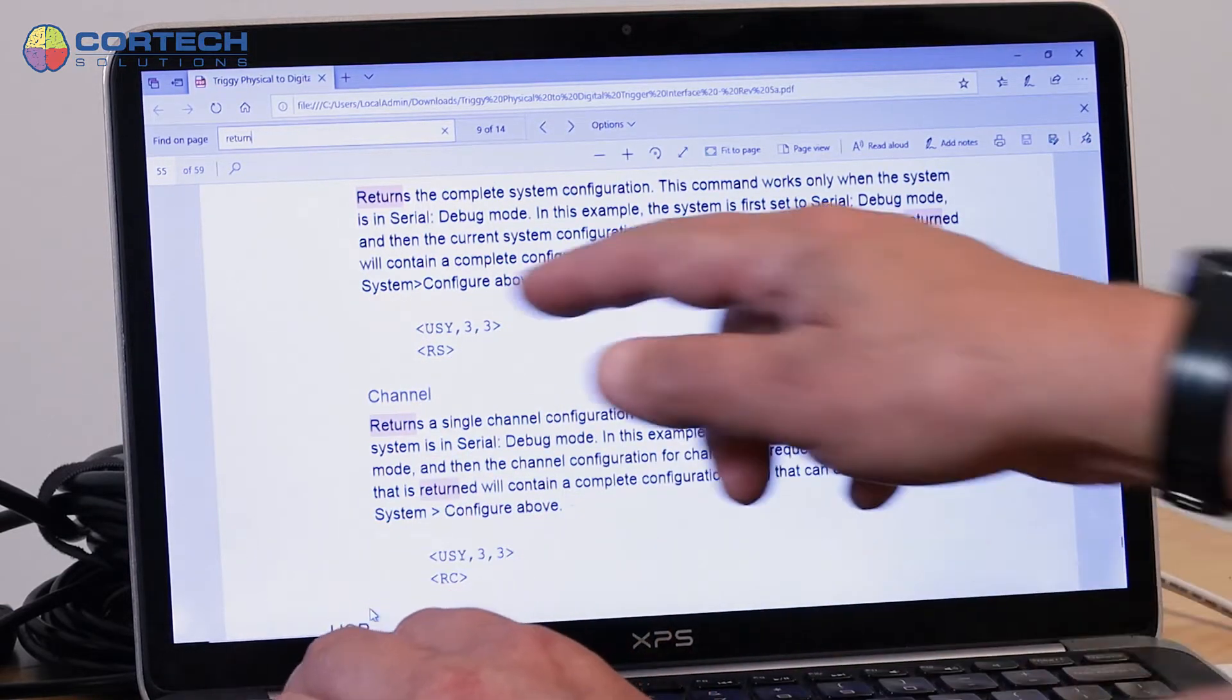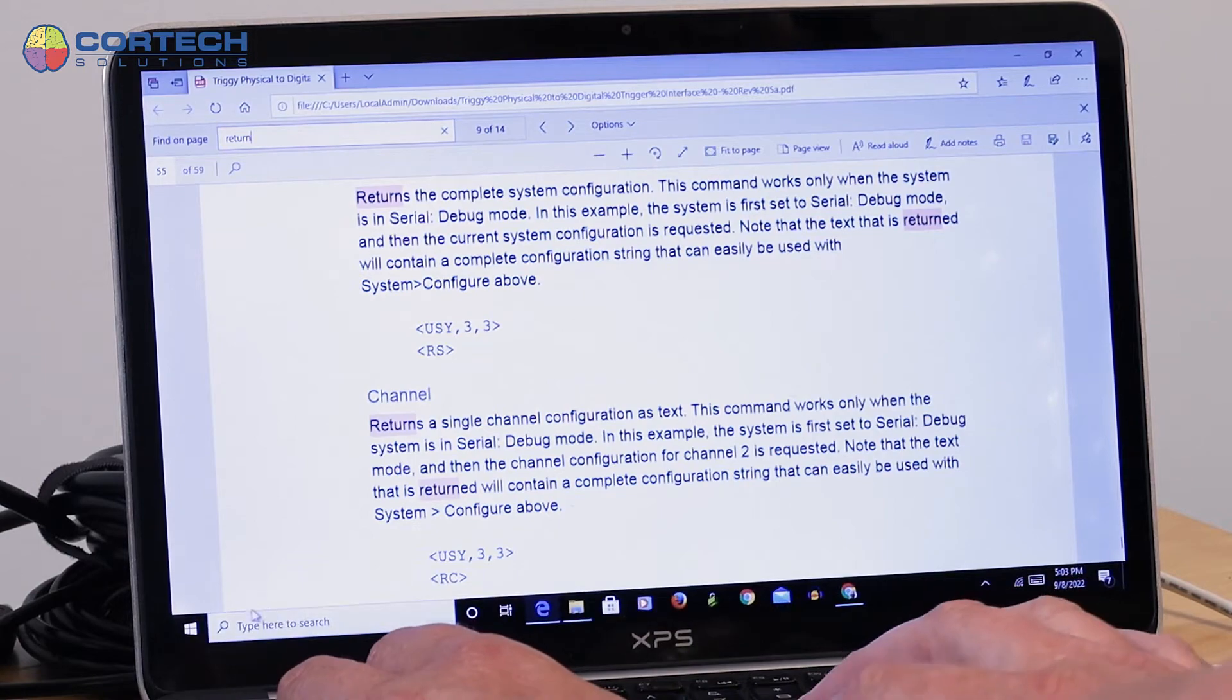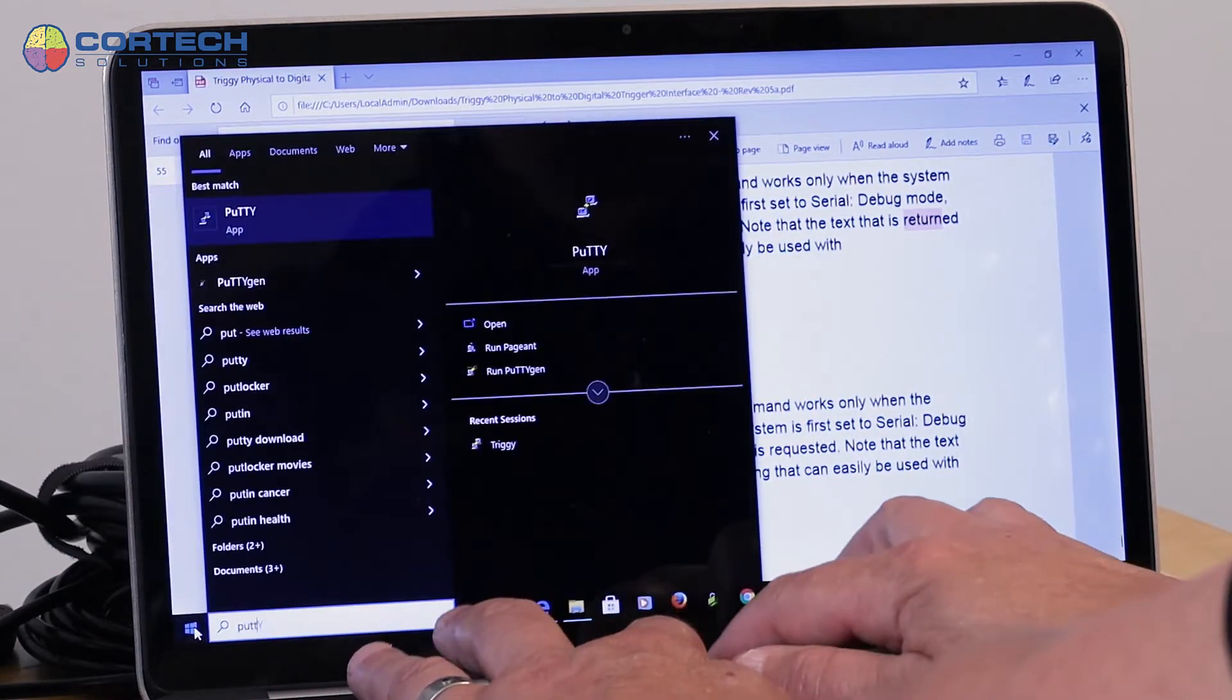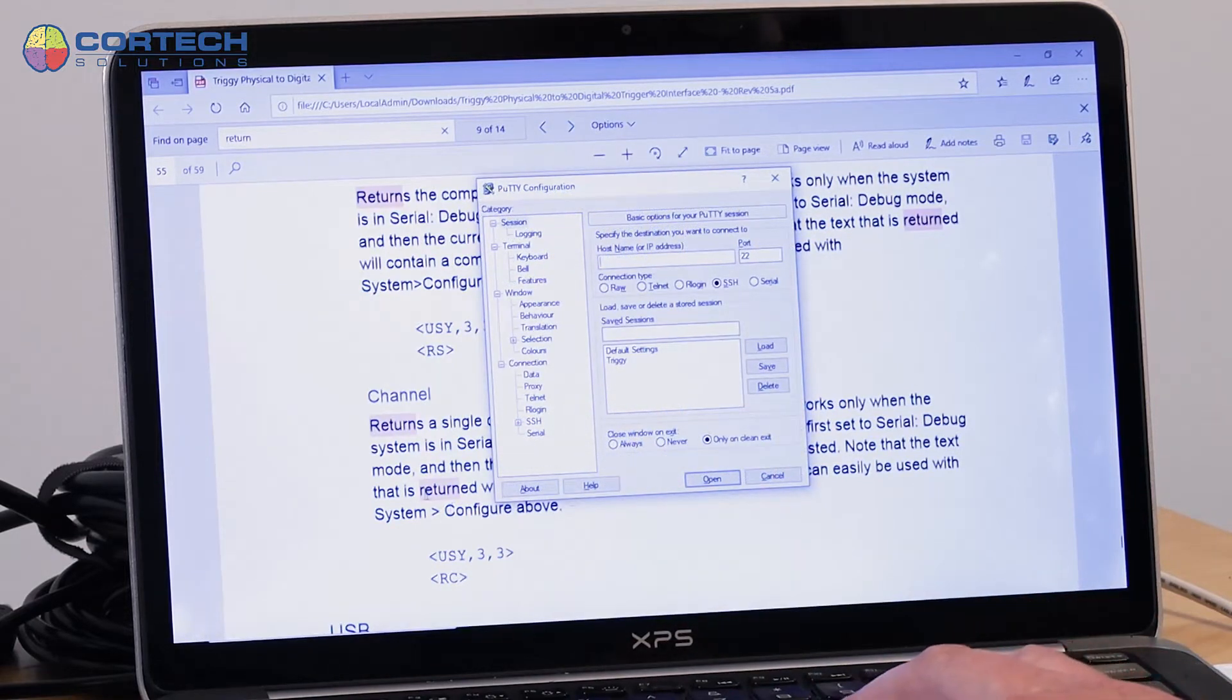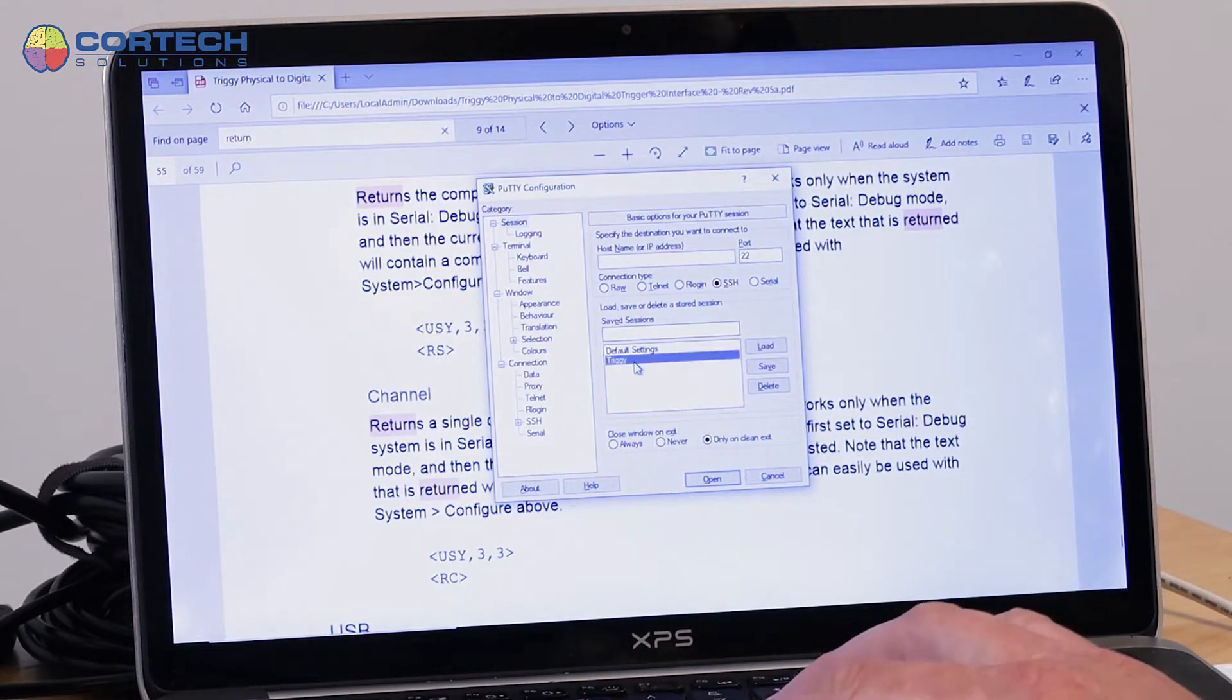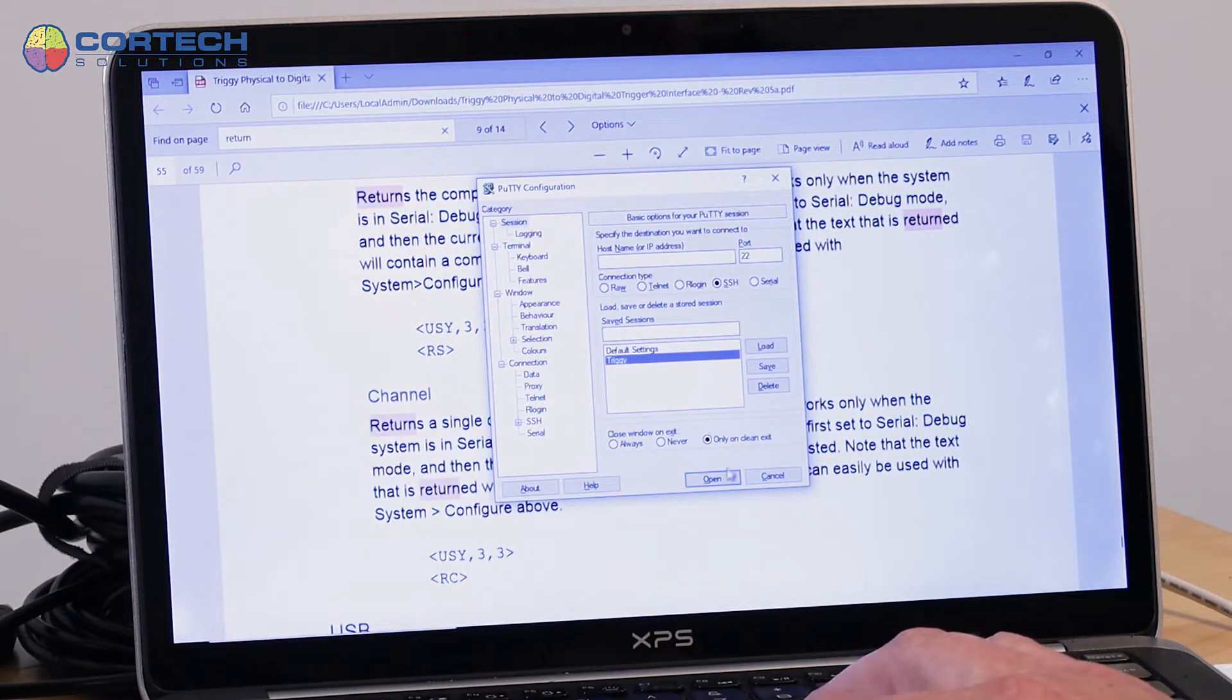So I can send that command using a terminal program. So I'm just going to open PuTTY, which is just a terminal communication program. And with PuTTY, I can open the Triggy configuration, which I described before.